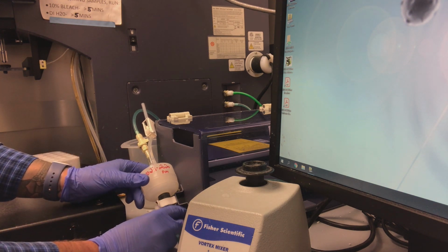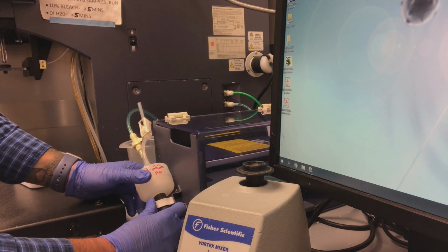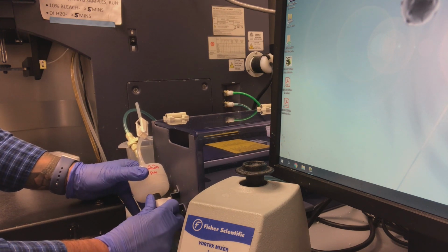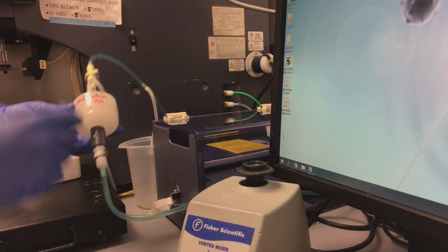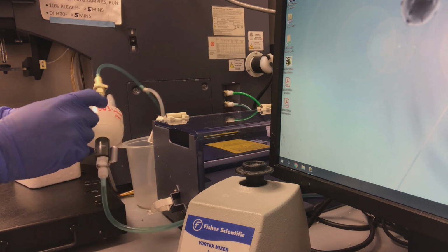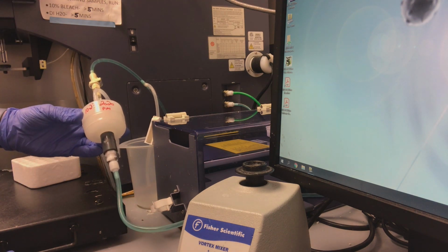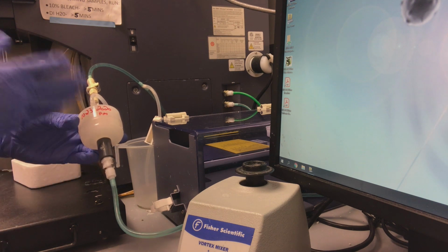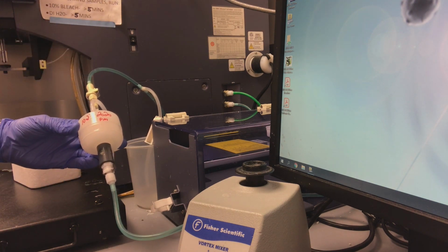we'll look right here next. This is our air filter. With two hands, you can remove this air filter and check to see if there's any air that has been trapped before going into the machine. It's important that we bleed this air filter to prevent any air from going up into the cytometer itself.